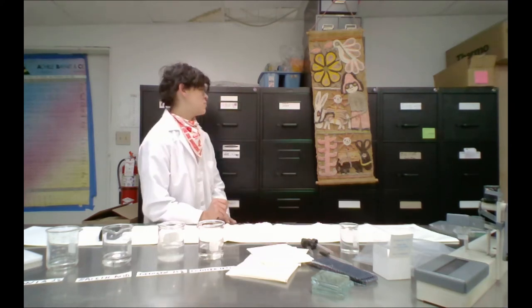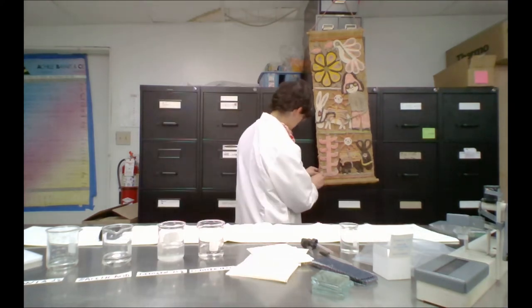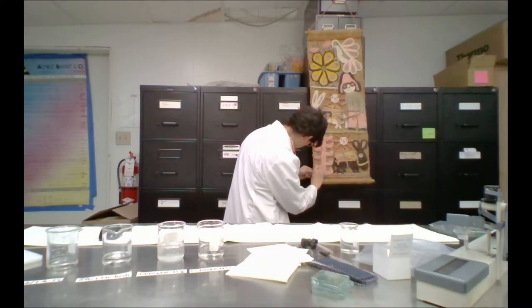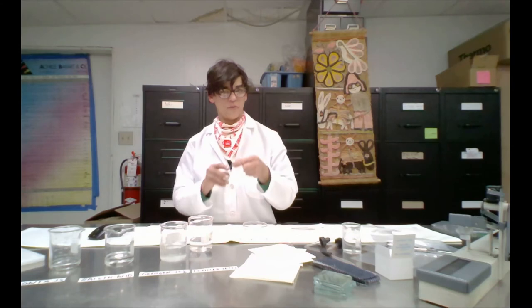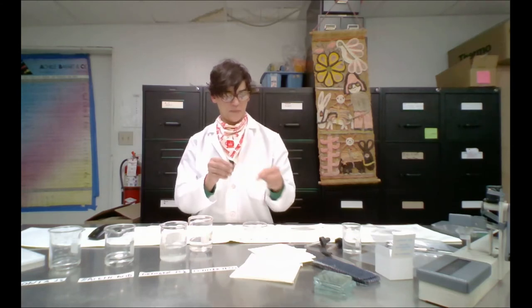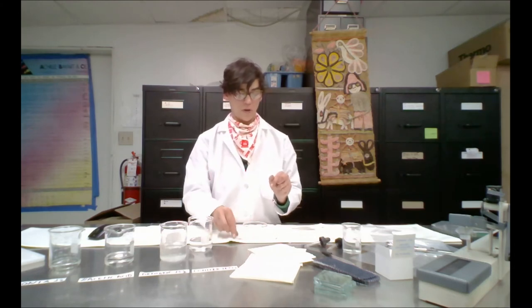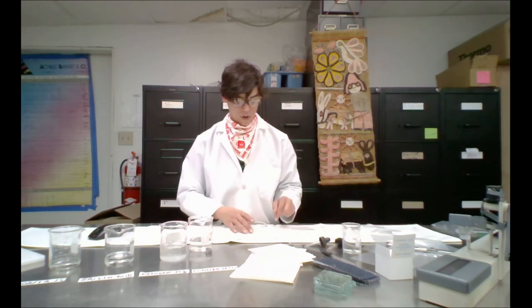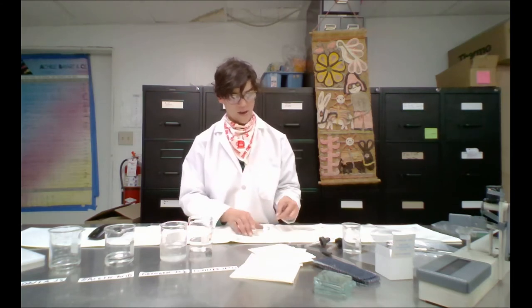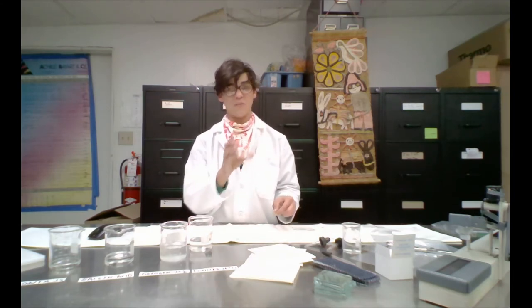So first we're going to take a small thread from the artifact, wet out a small thread sample taken from the textile. So we have our small thread samples here that I've removed from the textile, and now we're going to wet them out. I do have a petri dish to wet them out in.